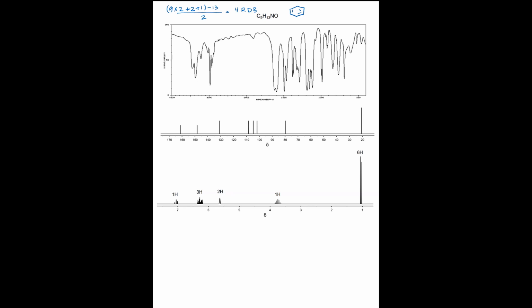We're going to look at the IR now and look for what functional groups we have. Again, I'm observing here I have sp3 CHs. And because I know I'm looking for benzene, I can also see here that there are some sp2 CH stretches as well. And this looks kind of like teeth. This is out here at 3400, so I'm thinking that is an NH2. If I look at the lower numbers here, this is around 1600, which is not quite enough for a carbon double bond oxygen, but these look like benzene ring stretches to me. And this one here looks like a CO.